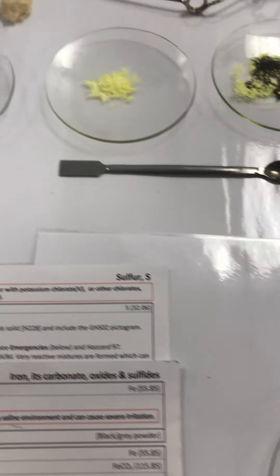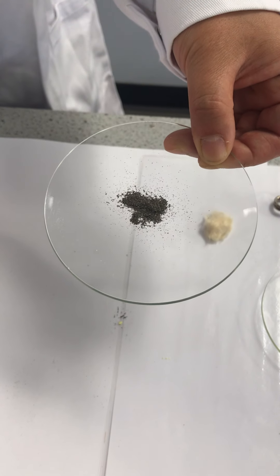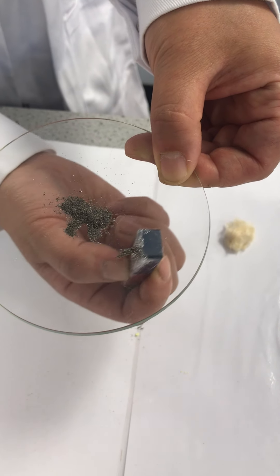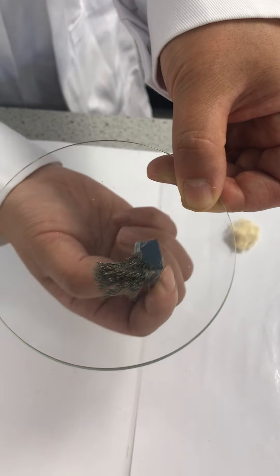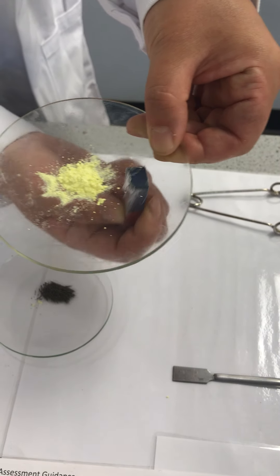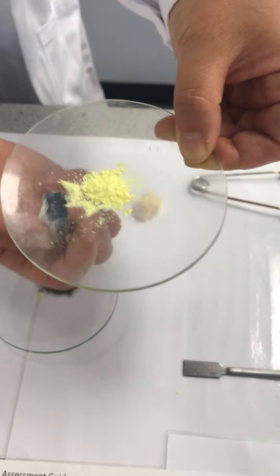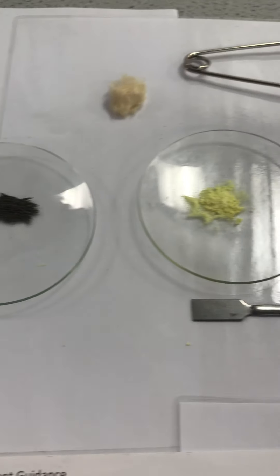Part two: we will observe the action of a magnet. If iron is sprinkled on a watch glass and a magnet is moved underneath, you will see the iron filings follow the magnet as they are attracted to it. If you repeat this with sulfur, you will see sulfur is not attracted to a magnet. We can now see iron and sulfur are two completely different elements — iron is a metal and sulfur is a non-metal.